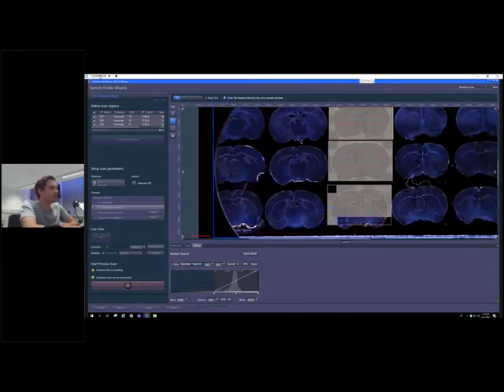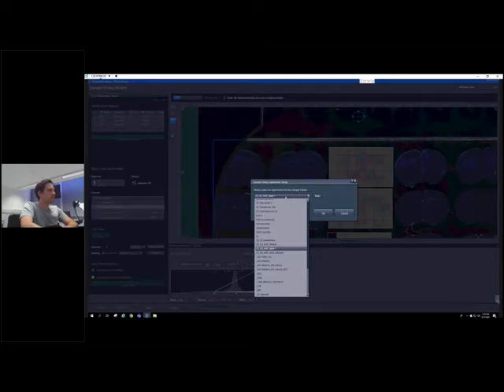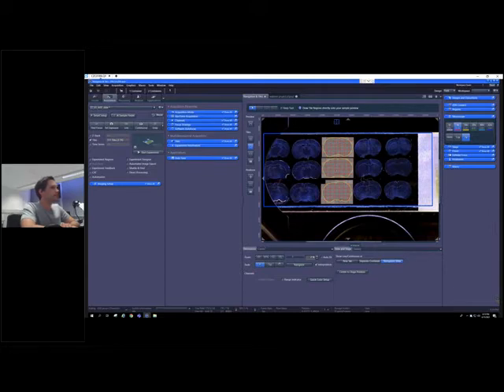And this would be the next starting point for a subsequent experiment. Of course, if you want to go directly with fluorescence information, you can also use fluorescence channels here in a preview scan. Once we finish this wizard, we can directly choose one of our predefined experiment setups or create a new one from this dialog. So very streamlined experiment setup within the AI sample finder wizard to link out directly to our subsequent experiment. And this is what I want to do next.